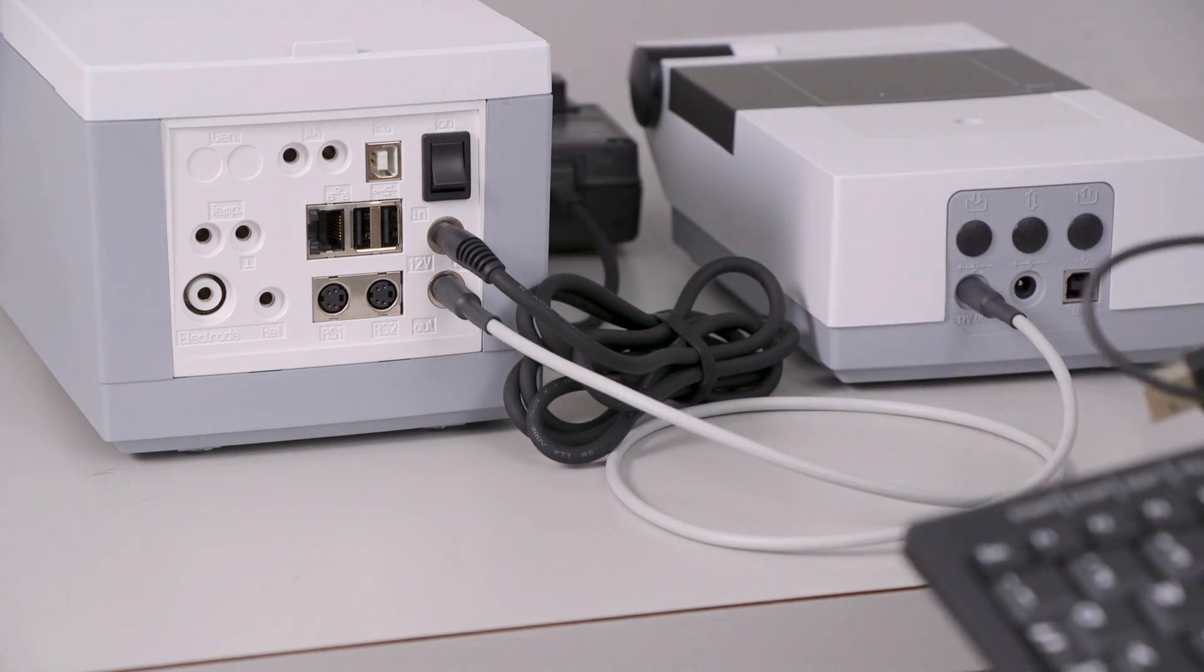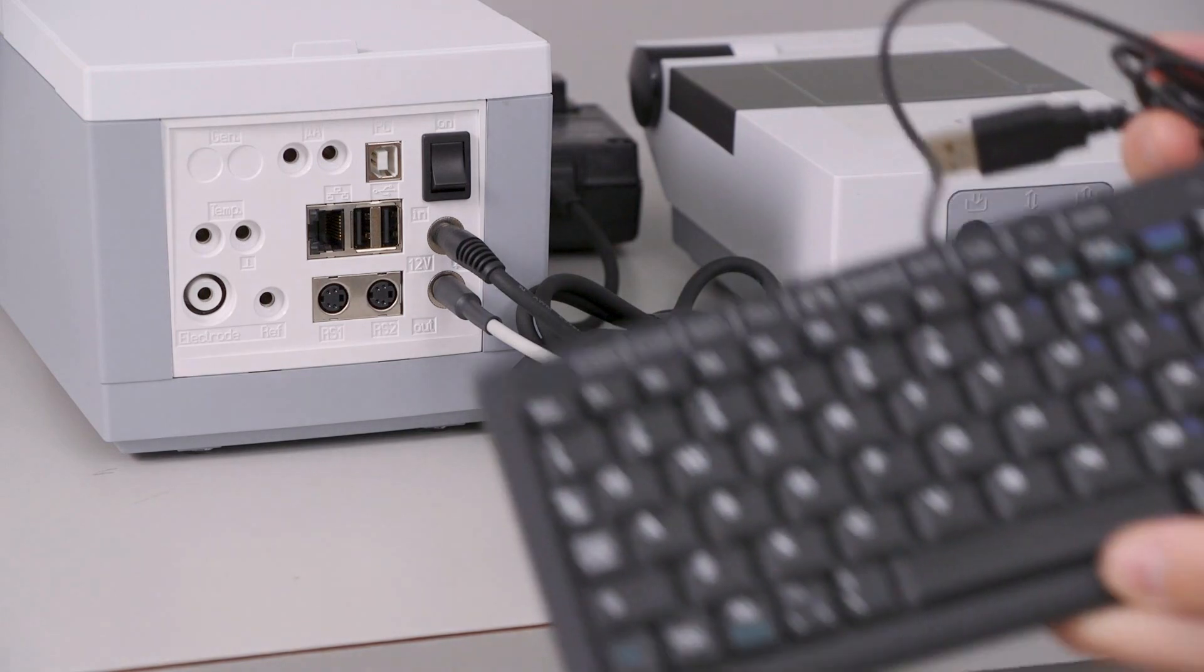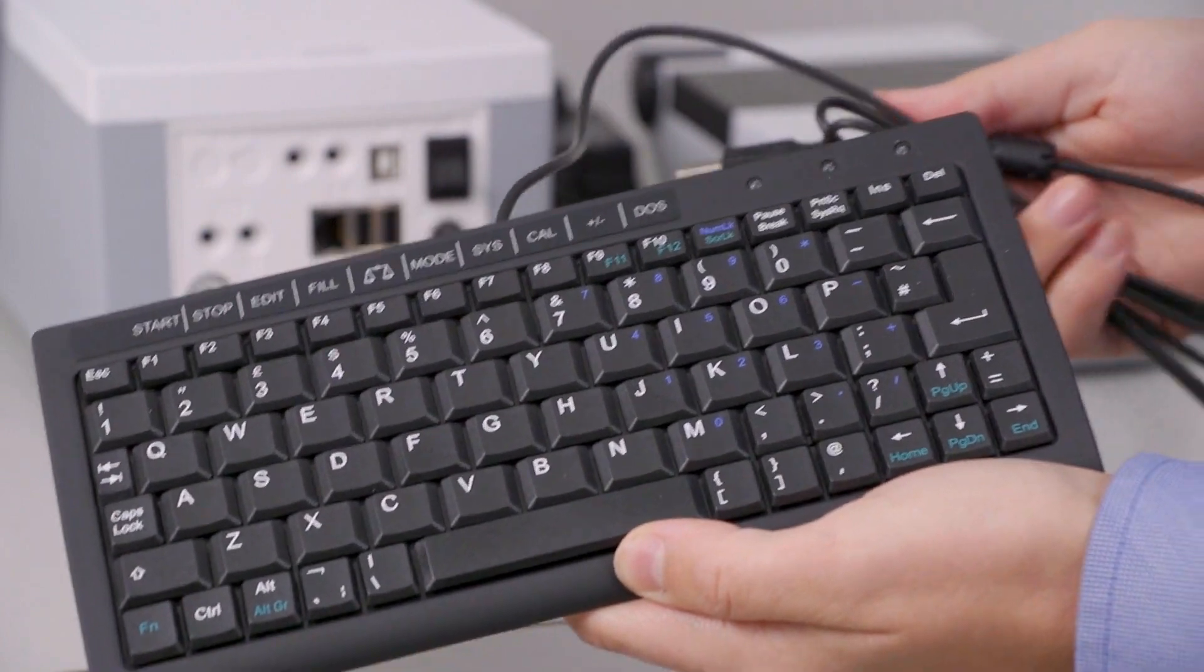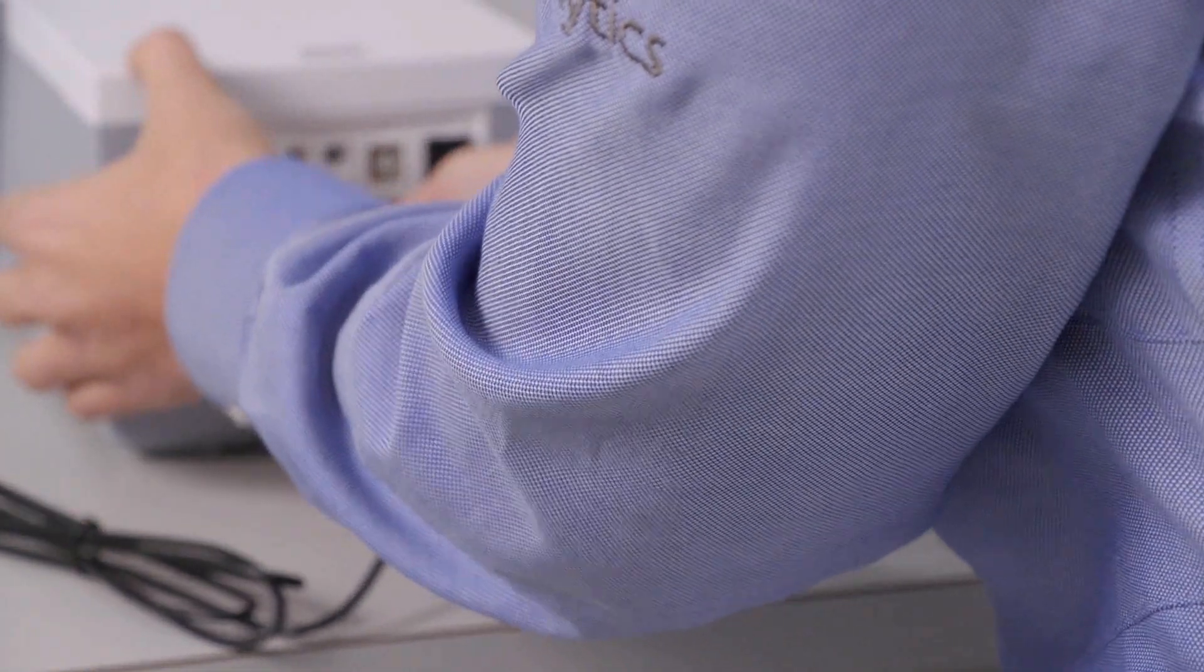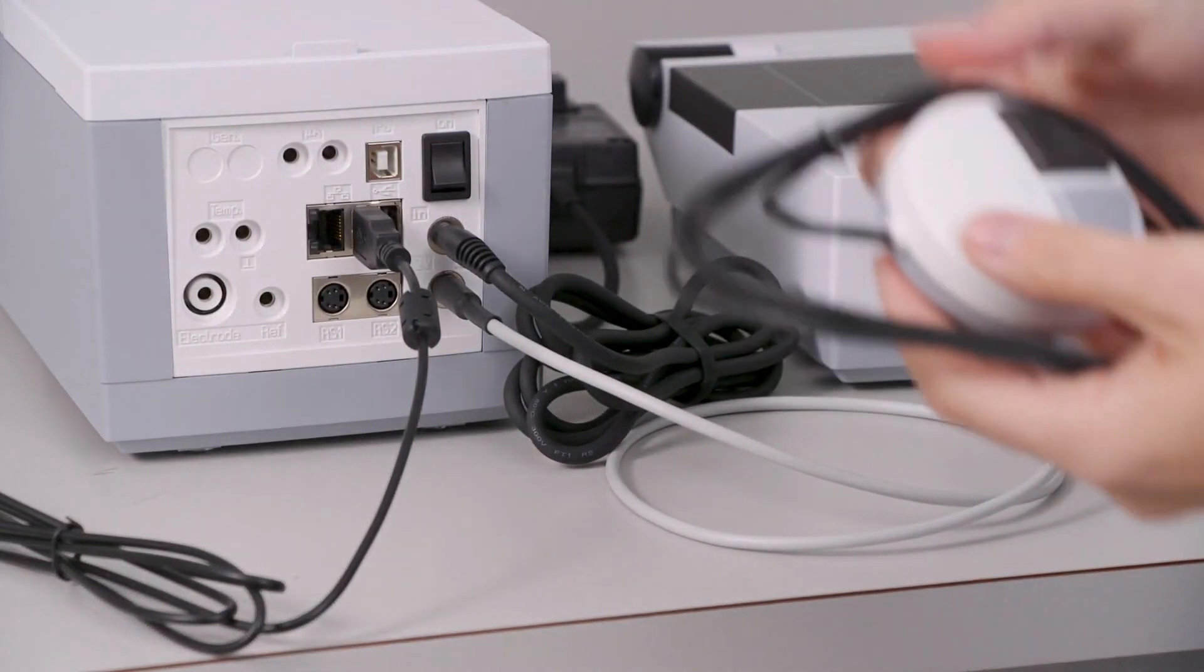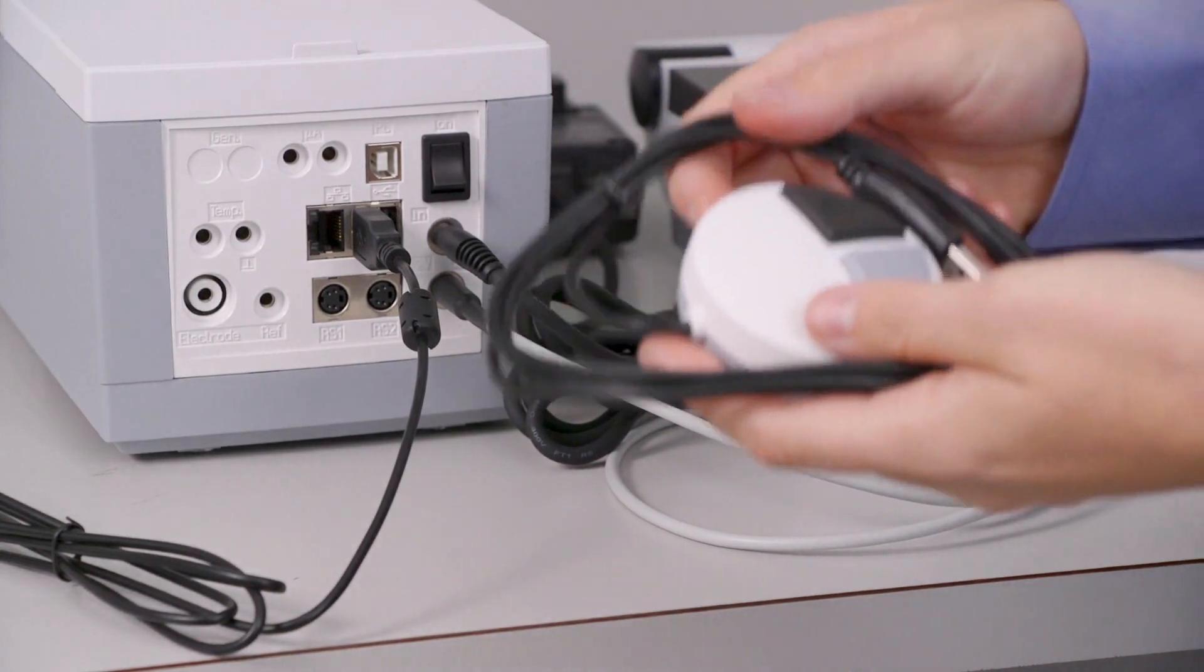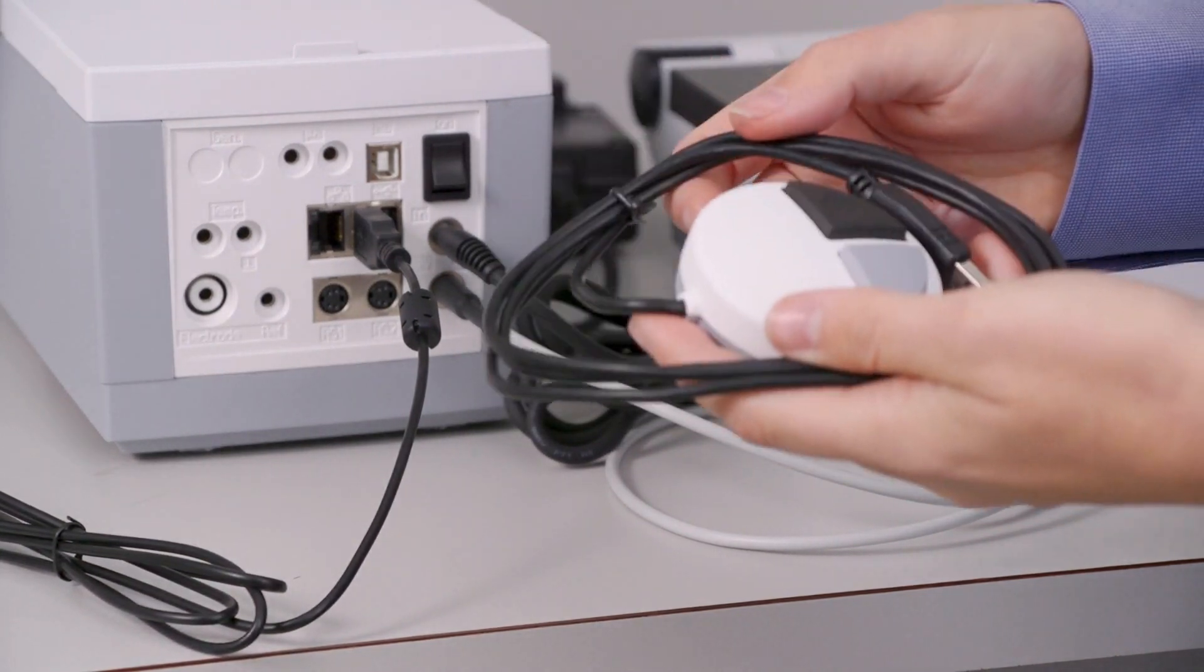Now is a good time to plug in any USB devices that you may have. One example is the mini keyboard that comes with all of our titrators. You can plug this into any of the USB ports that we have. A manual controlled mouse also comes with all of our units, but in this case we're actually going to skip it because we're going to be running auto-titrations.